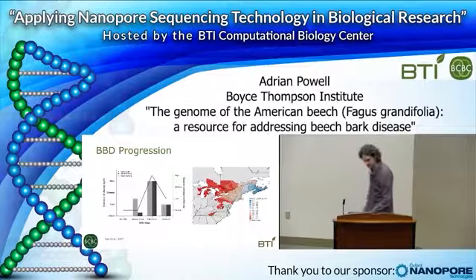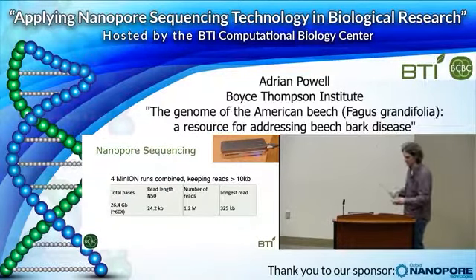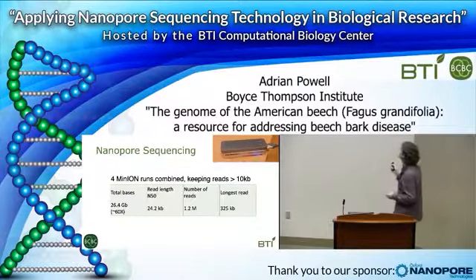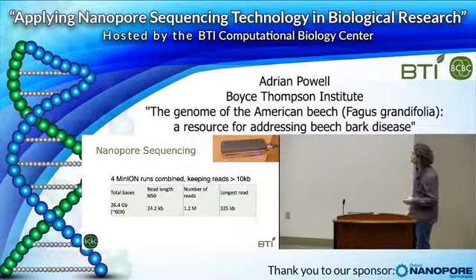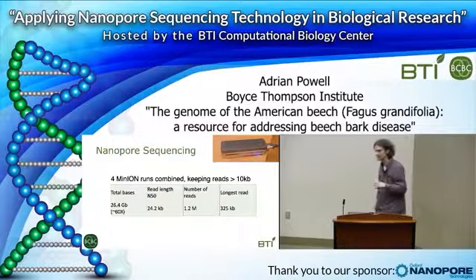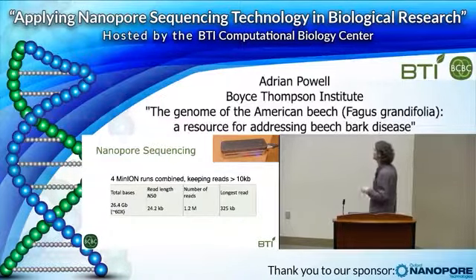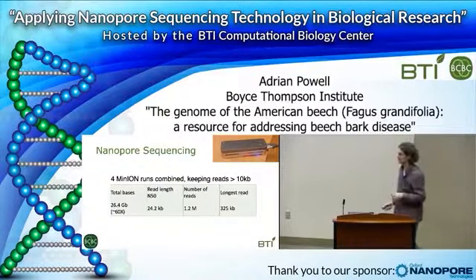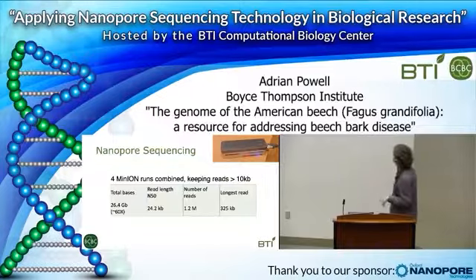So for that, we're using Nanopore sequencing, and we're combining the data from 4 MinION runs, keeping reads greater than 10 kilobases. We ended up with 26 gigs of data, read length N50 of 24 kb, and our longest read that we got for this was 325 kb.